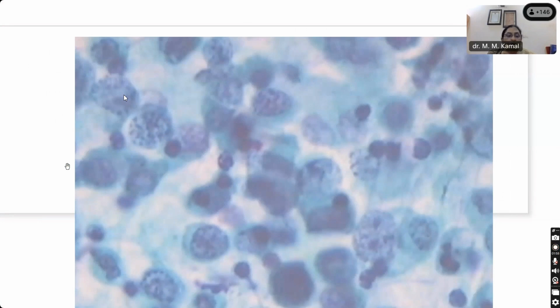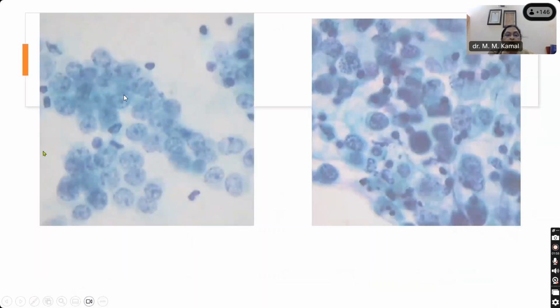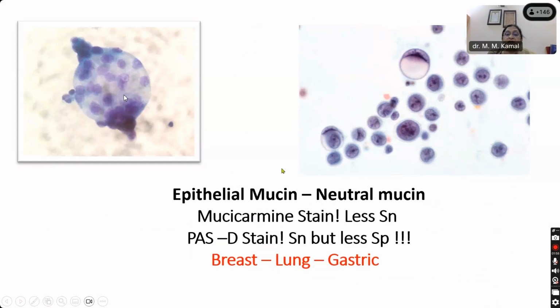Okay. Yes, so you have described it very well. You have given a very perfect description. And now we were talking about morulae, cell balls, cell clusters, cannonballs. But as the differentiation of the cells becomes poorer, you can get so much dissociation that they start resembling poorly differentiated carcinoma. This is one feature. What is this?